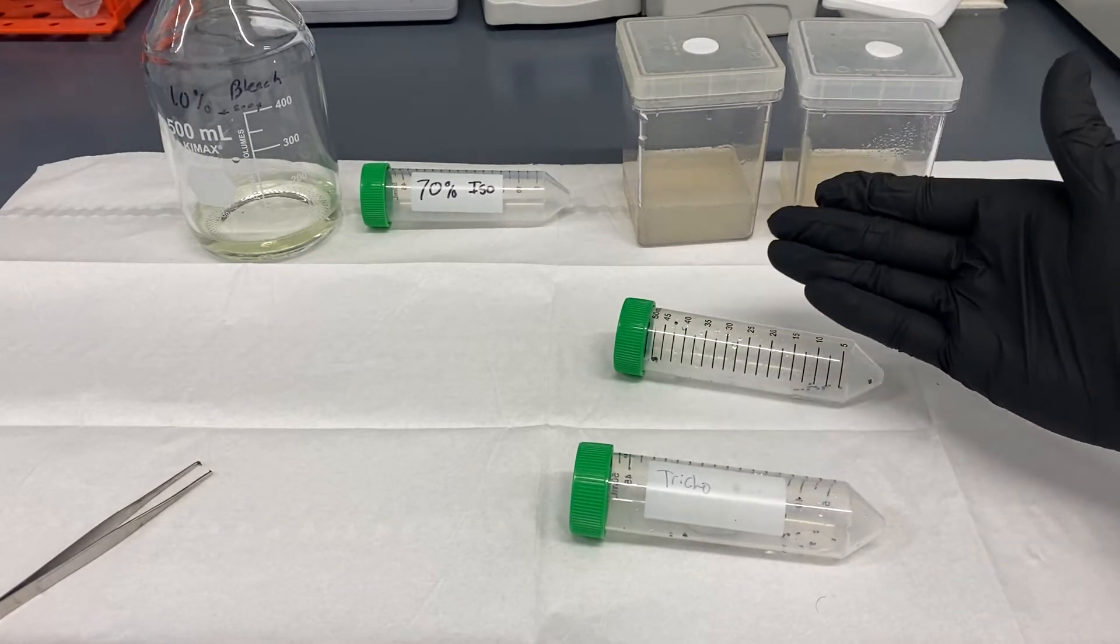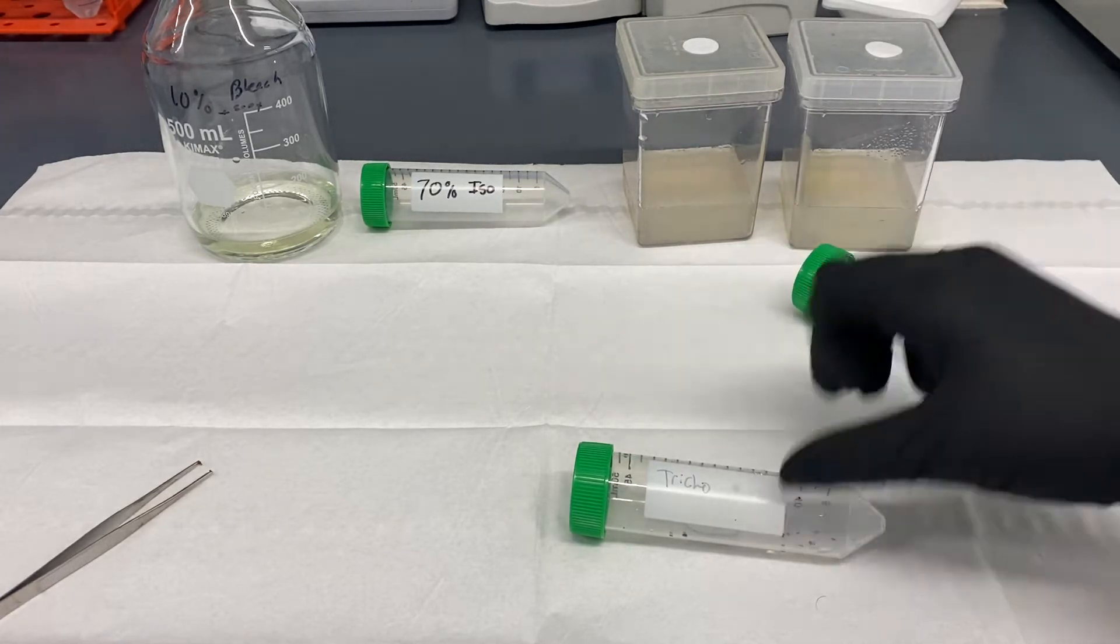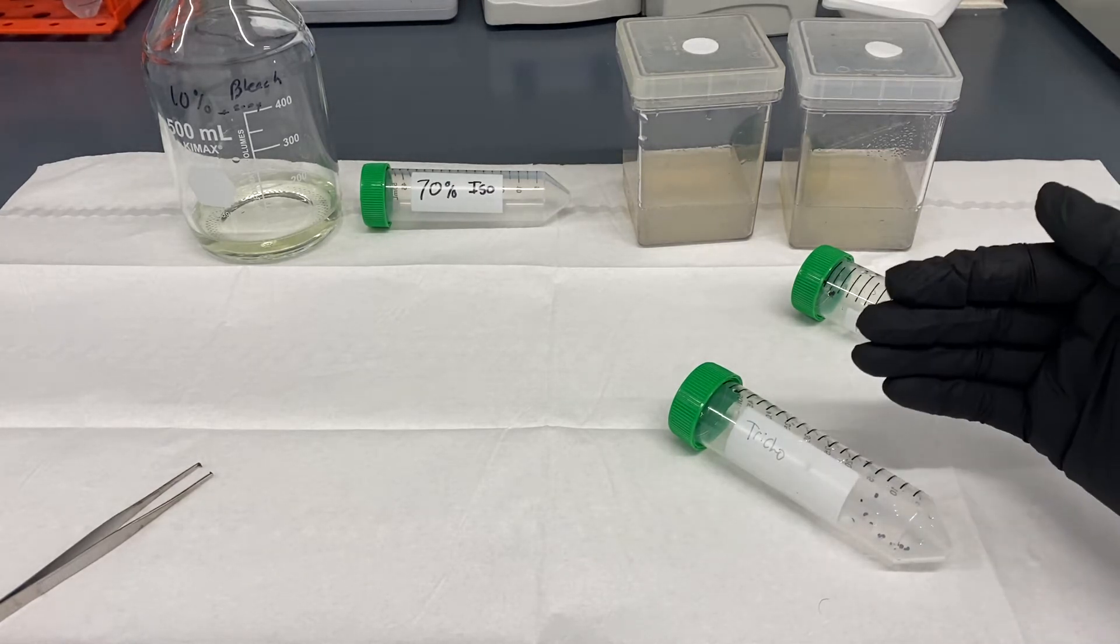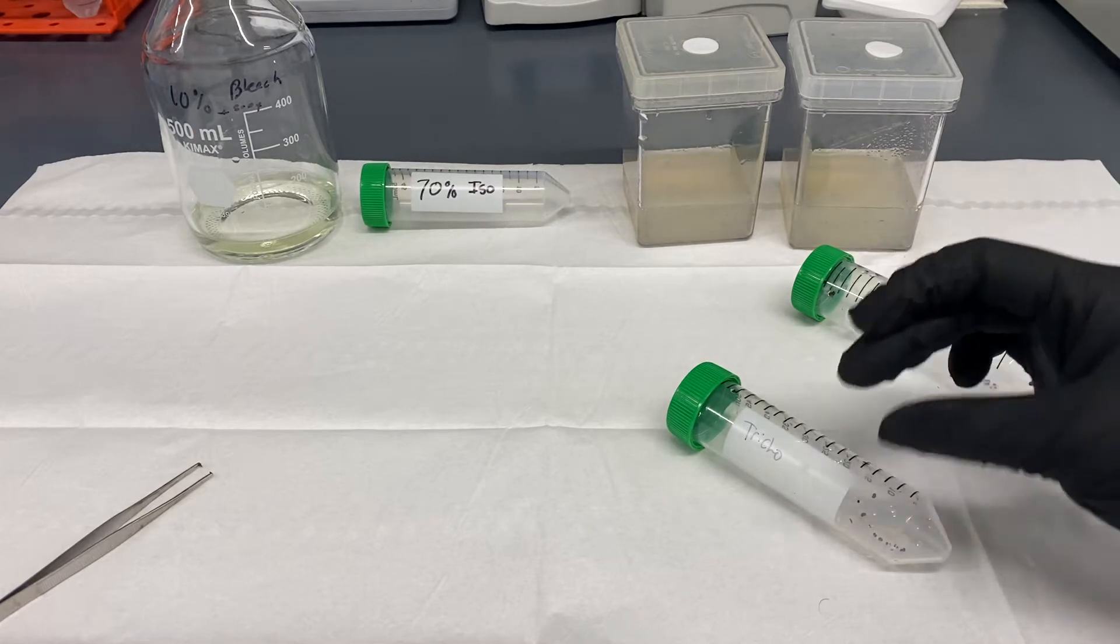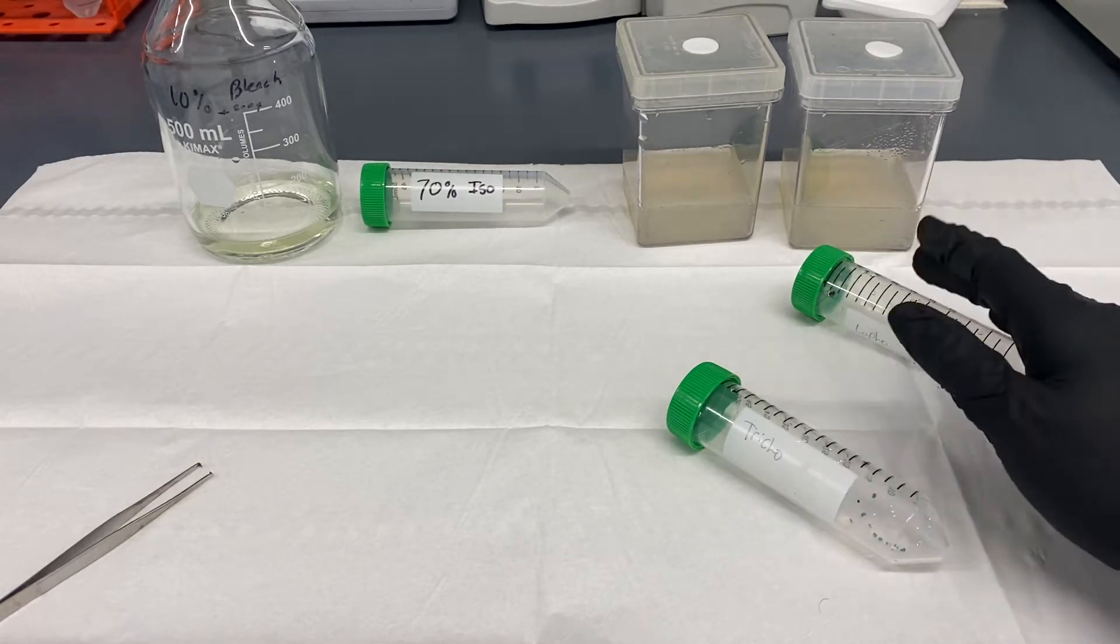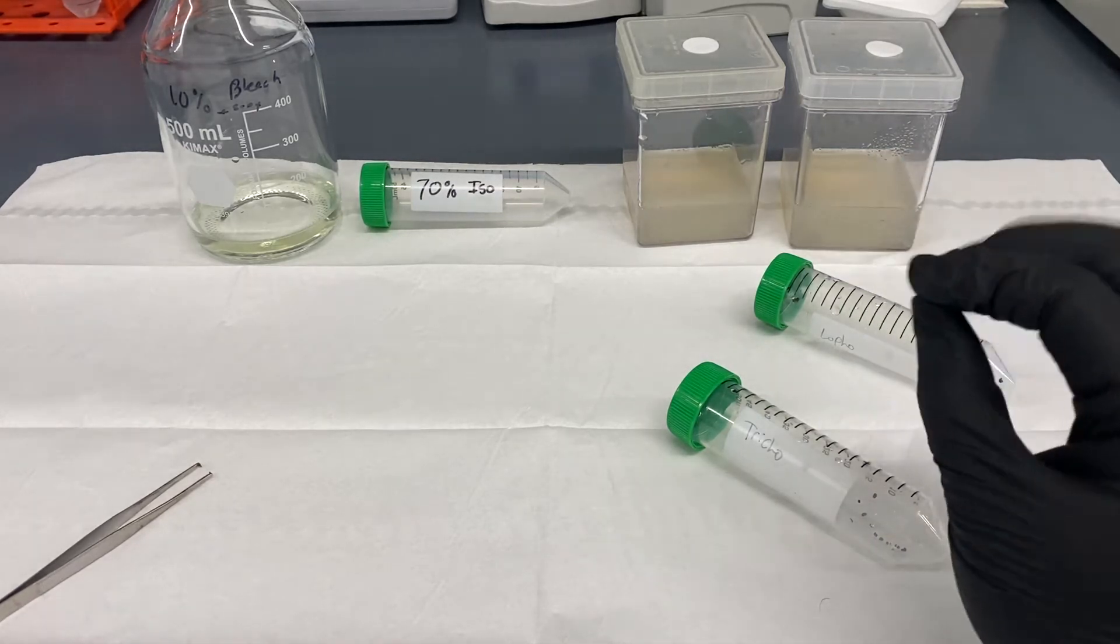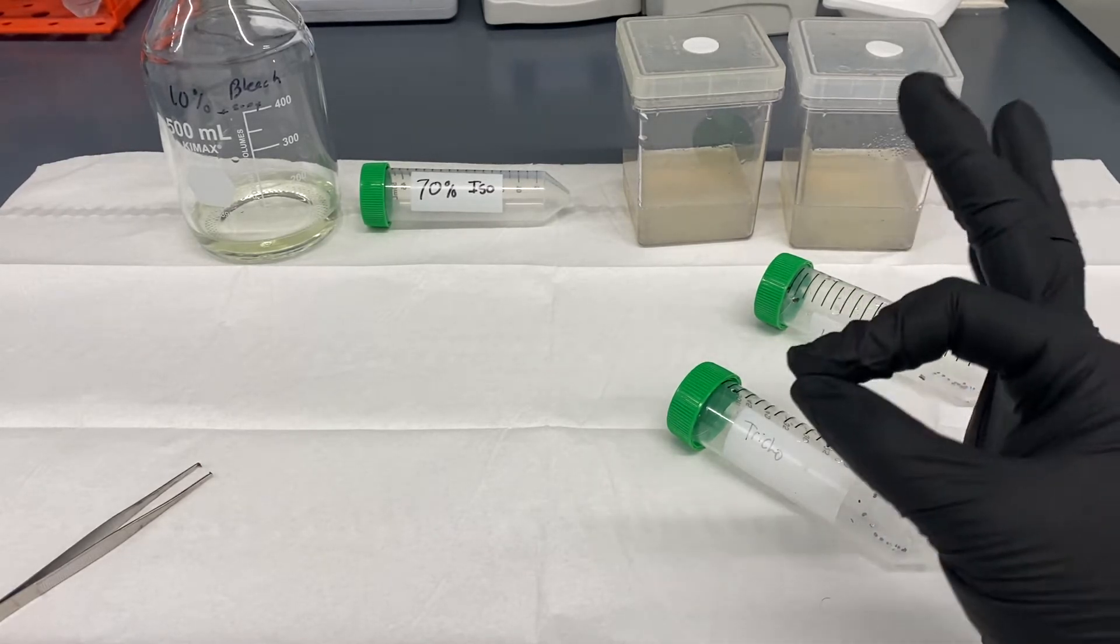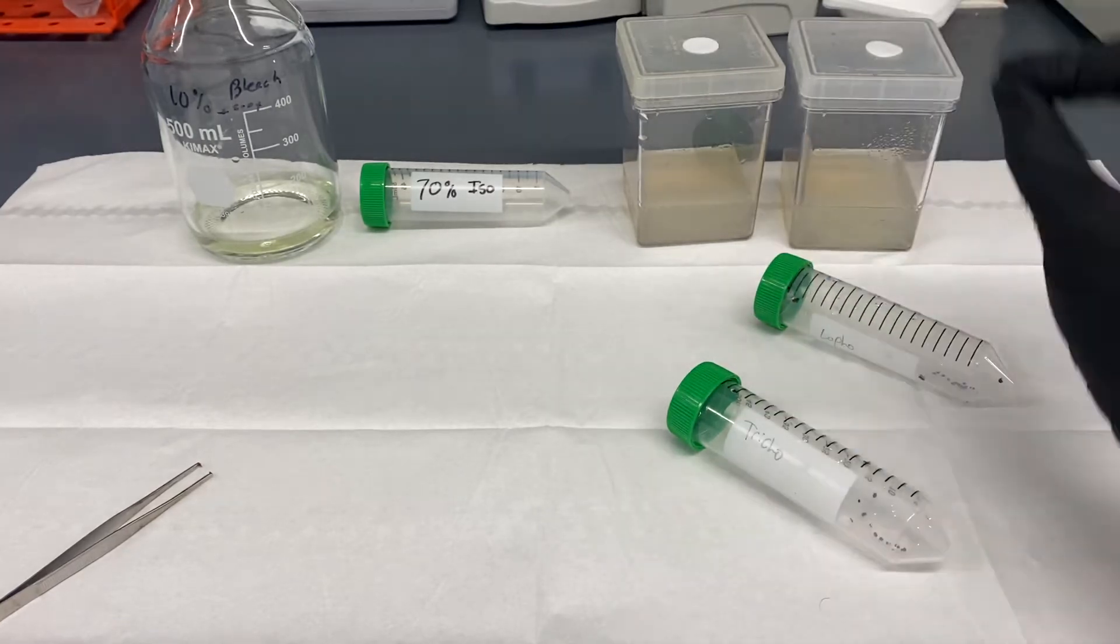So in this case we are concerned with either taking tissue that already exists and making more shoots, a multiple shoot culture, or using nodes, a nodal culture. Or there's also a meristematic culture where you actually trim off all the tissue and you only take the meristematic or the stem cell core of a plant and you place that on media for complete regeneration.